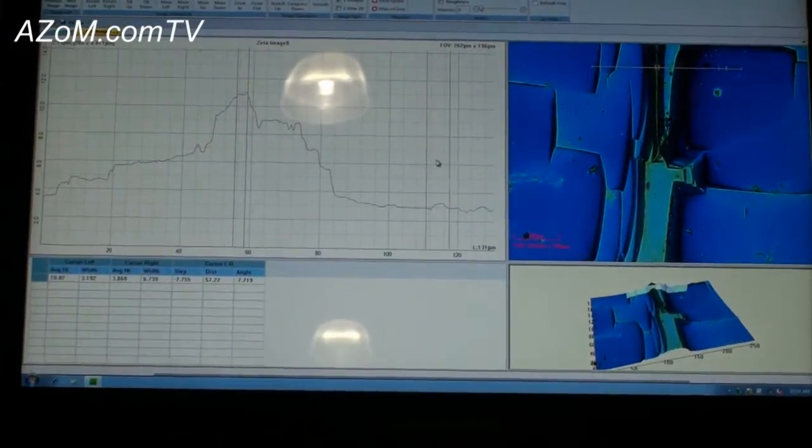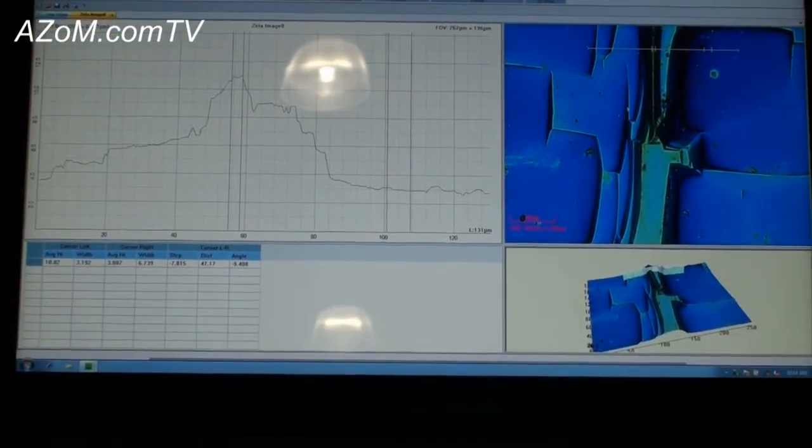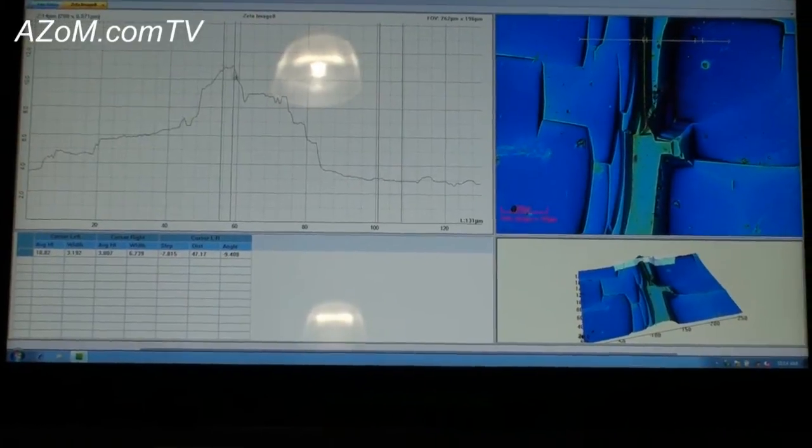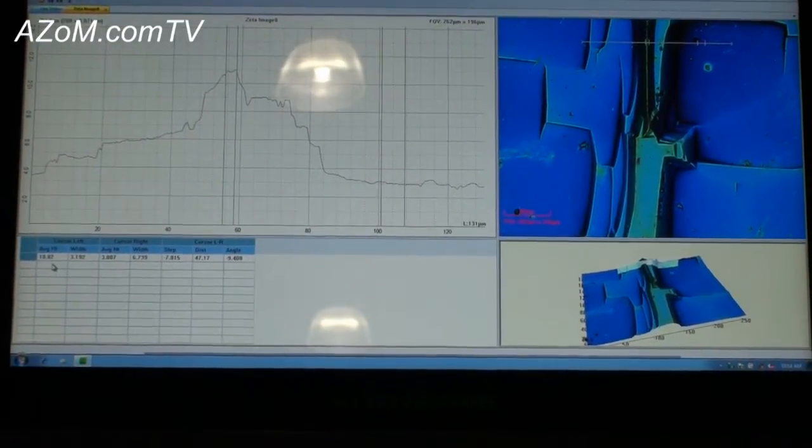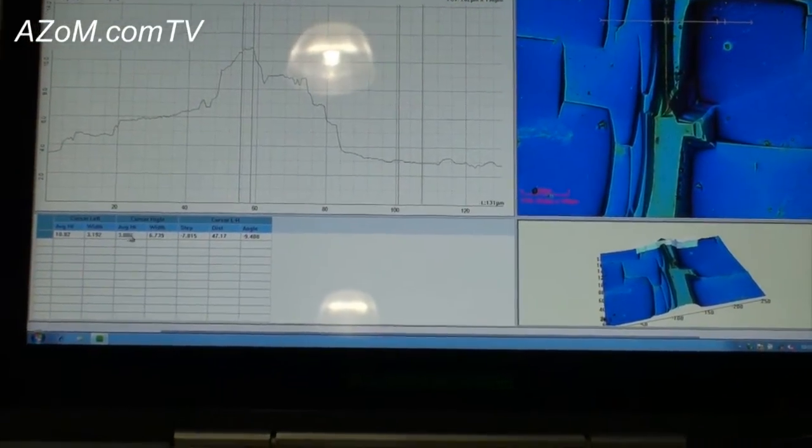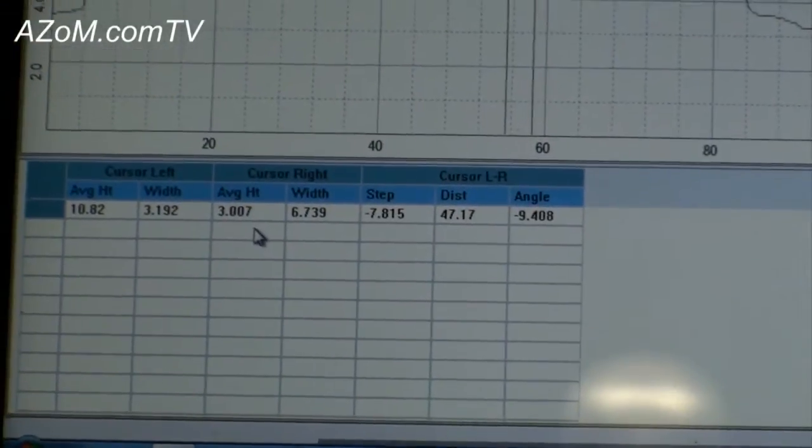You can actually see on the 2D composite where I'm actually located on the actual image. So this cursor pair average height from scan is 10 microns. The average height of the second cursor pair is at 3.